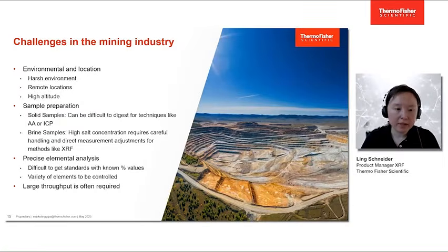Now let us discuss what challenges the mining industry is facing when it comes to elemental analysis. The mines are often located in remote areas where the weather condition is harsh. Some mines are even located at high altitude area. In the high altitude area, the lower air pressure increases the risk of arcing in high voltage equipment, which requires really special configurations to ensure reliable long-term usage of instruments, especially for XRF.